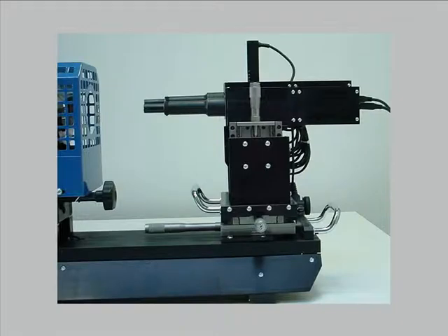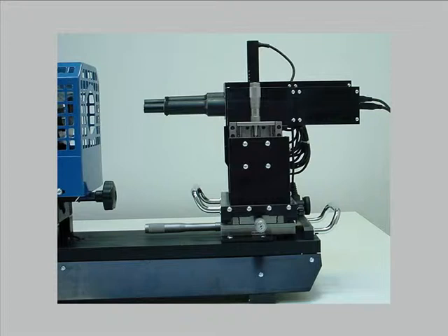The optical setup is based on two digital cameras equipped with long focal microscopes which are able to achieve an actual magnification of 0.6 microns per pixel.